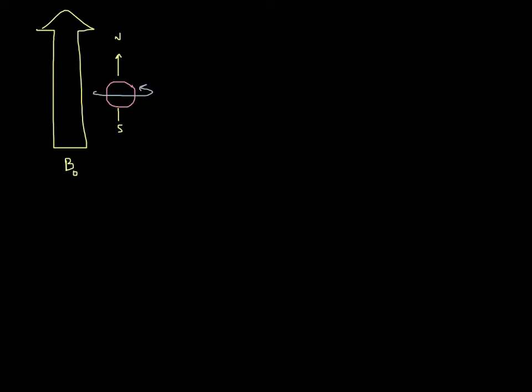Sounds a little bit weird, but let's talk about, really quickly, what is an odd mass atom? So carbons have a mass of 12, so they don't have a spin associated with them. Hydrogens have a mass of 1, so they do have a spin. I'm going to draw out ethanol.